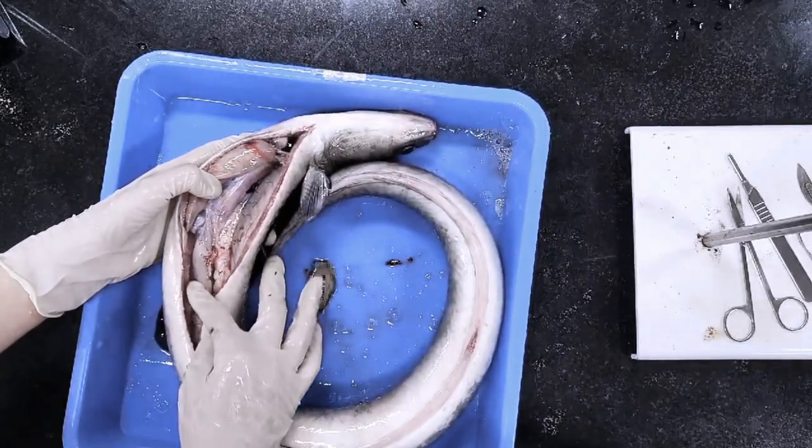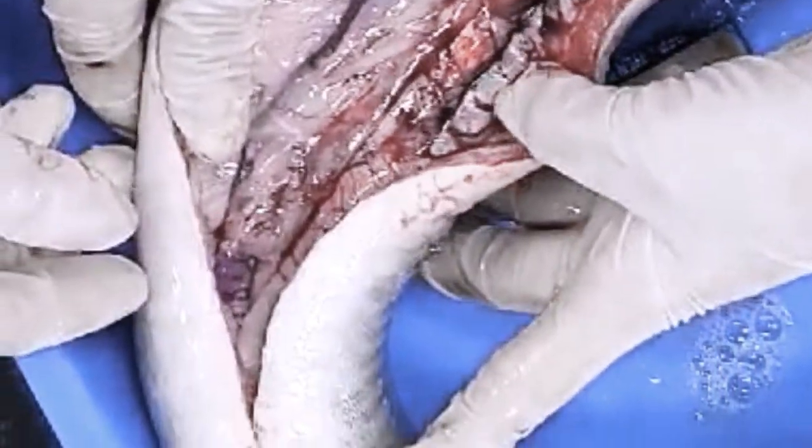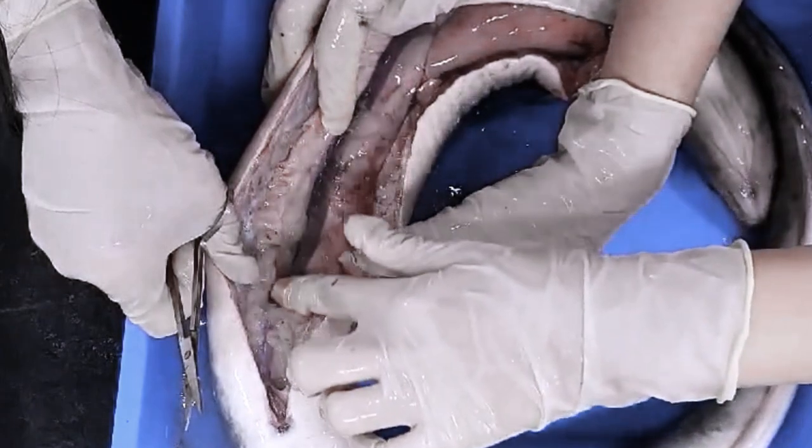Tracing down from the esophagus, we reach its stomach and intestine. Both organs have folds to maximize food digestion and nutrient absorption.